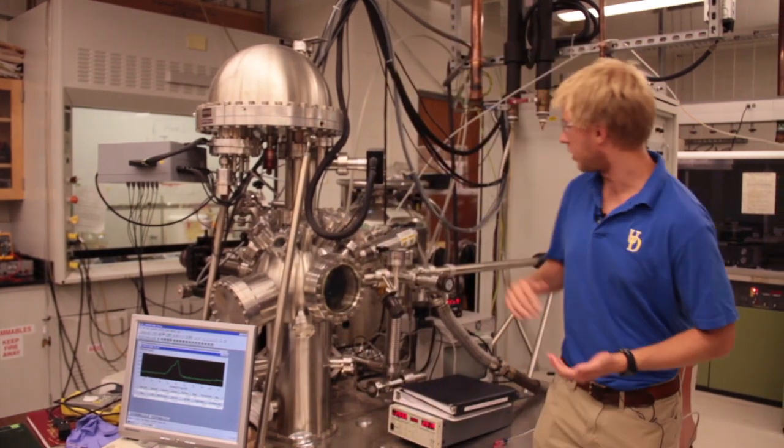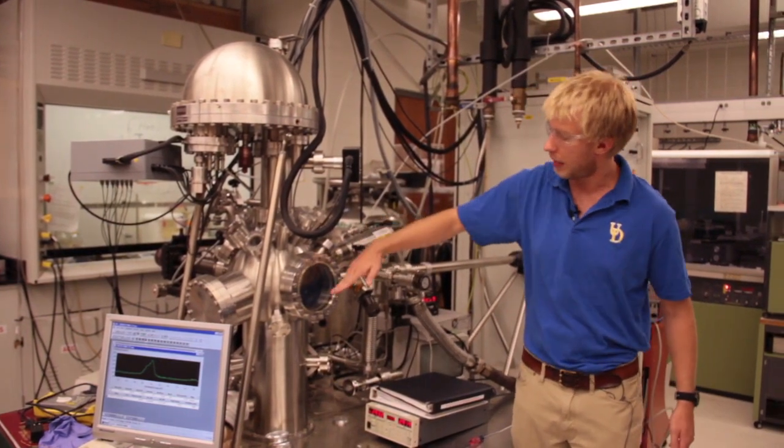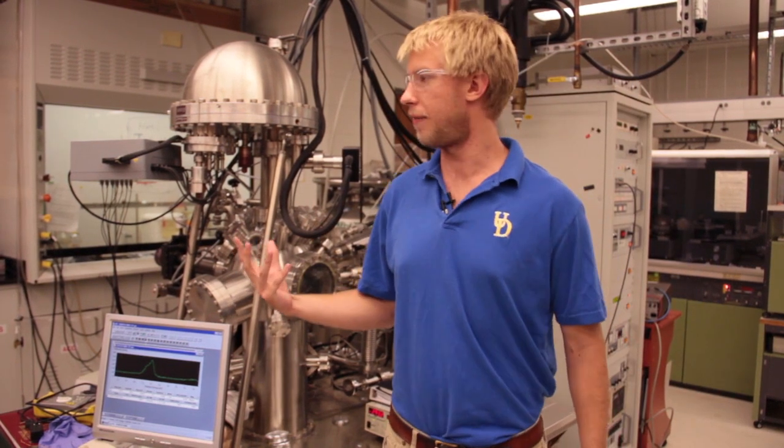We probe this matter by shooting these X-rays out of this tube at whatever our sample is. The X-rays come out at a certain known energy and they knock off electrons.